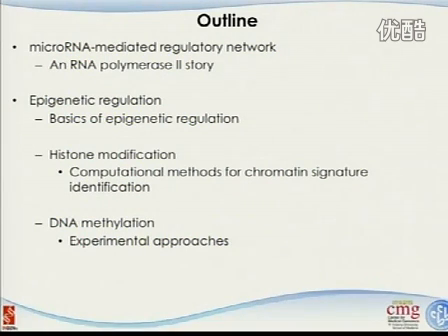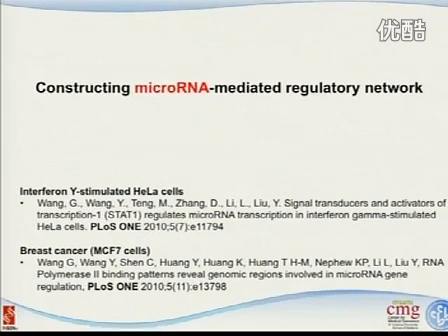And for the DNA methylation part, there are even fewer analysis tools. But I'm going to tell you about several different experimental approaches using next-generation sequencing. Basically, this will focus on the experimental part.